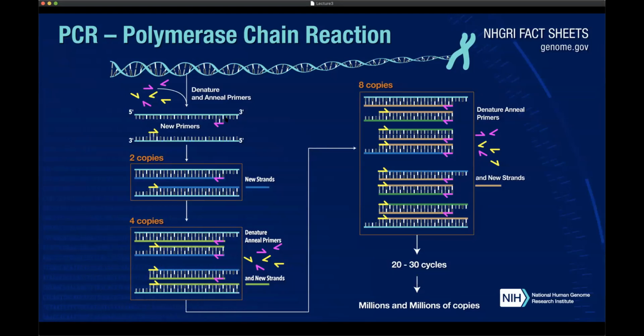And in order to amplify, there are obviously a lot of trickery involved here. So PCR, even though it's a very established technique, there are a lot of variants of it, and it can very easily be done poorly. And if it's done poorly, you can have all kinds of things that you don't want to happen. You can have polymerization errors, you can have things that recombine, you can have poor amplification, and so on. But when somebody tells you today that they did a nucleic acid test for SARS-CoV-2 or anything that is a virus, it is based on the PCR test. So there are primers involved, and there's this step involved when you take a small amount of viral DNA and you amplify it.